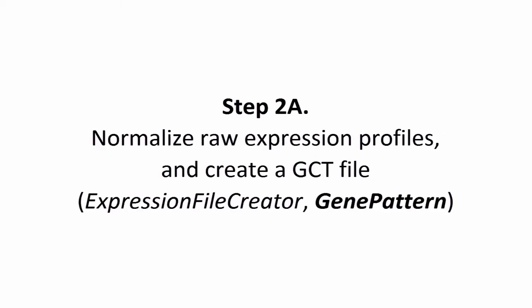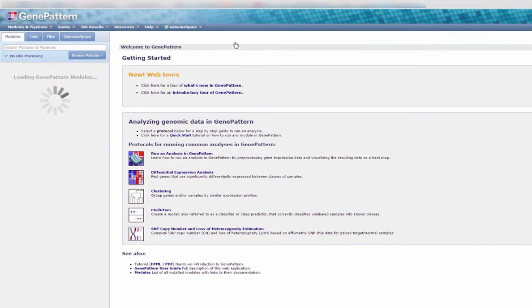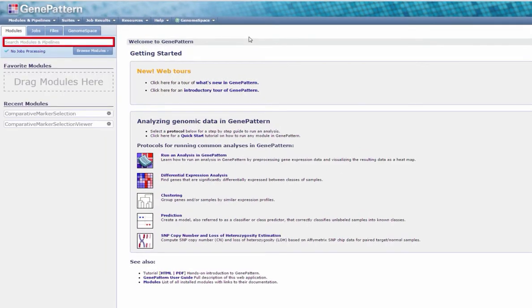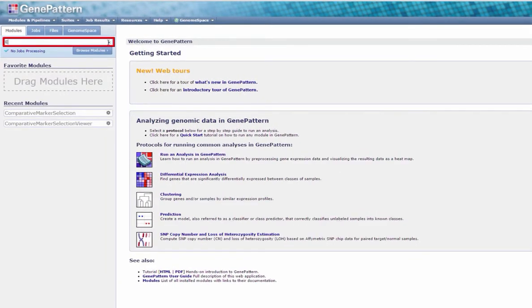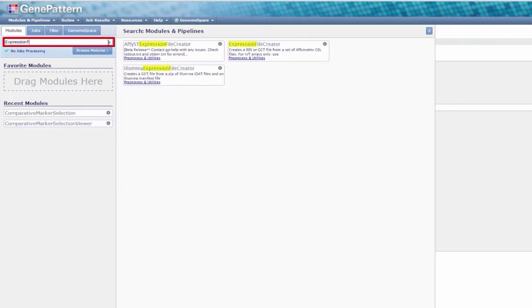Step 2a. We begin by normalizing raw expression profiles and creating a GCT file using GenePattern's Expression File Creator module. If you have yet to open GenePattern, click the GenePattern icon in the Genome Space toolbar. In the Modules tab, either search or browse for the module Expression File Creator and select it from the slide-out menu.